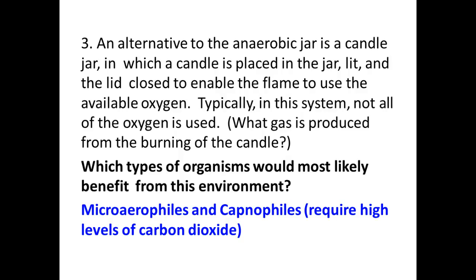And because of the increased levels of carbon dioxide, our capnophiles would grow. These are ones that require higher than normal levels of carbon dioxide. So you'd either have to pump carbon dioxide into an incubator or grow them in this particular environment in order for them to grow.